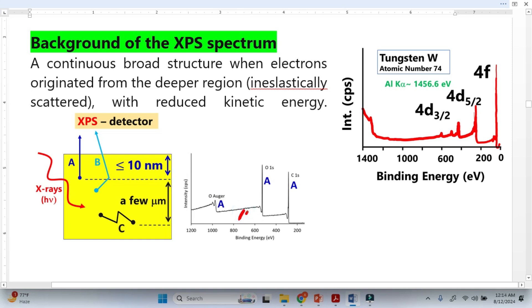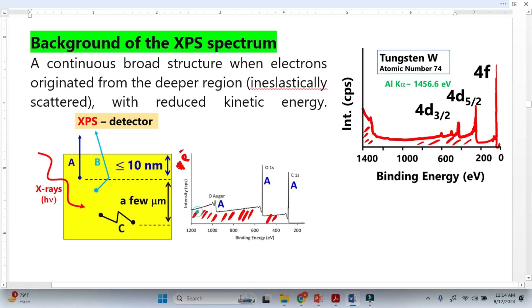Why is there a background in every XPS spectrum? This is very conceptual information. If you look at this XPS spectrum for tungsten, there is a background here, and this background increases as we go toward higher binding energy. Looking at the y-axis, these represent the number of electrons counted per second. This means the background is also at a certain intensity, so the background is also made from electrons — the XPS detector detects electrons.